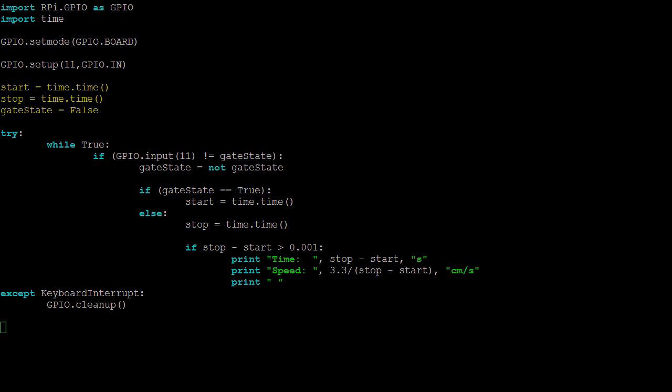Next, we must assign initial values to the three variables that we'll need in this program. The start and stop times will be used to record the time that the sensor is blocked and unblocked respectively. Gate state is used to compare the most recent recorded state of the photogate with the current value of the GPIO input pin. As the gate should start empty, gate state and the GPIO pin will both start as false.